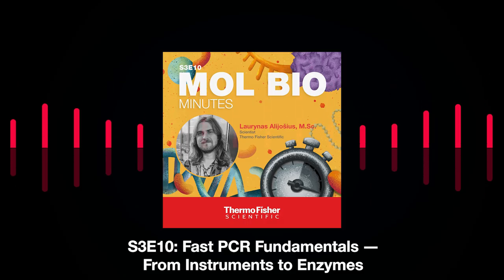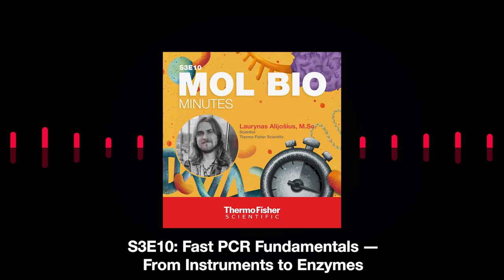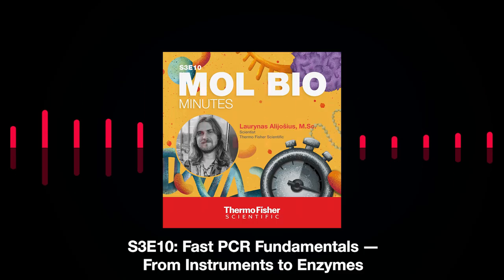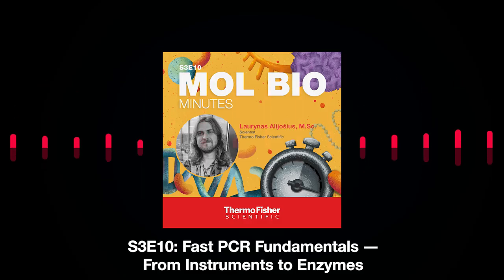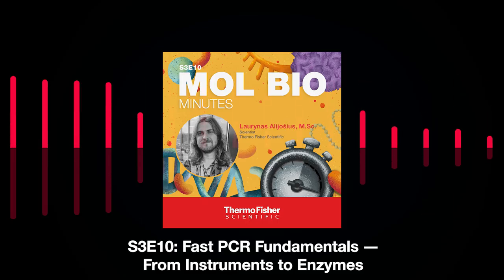And the main difference between the wild type polymerases and an engineered one in terms of PCR is that the wild type ones usually are slower. So let's say their DNA sequence elongation time could take even like 1 minute for 1 kilobase. On the other hand, if you decide to use the engineered DNA polymerase, you can reach elongation speed up to 5 seconds for 1 kilobase. I mean, that's crazy speed. The difference feels like a race between a horse and a spaceship.